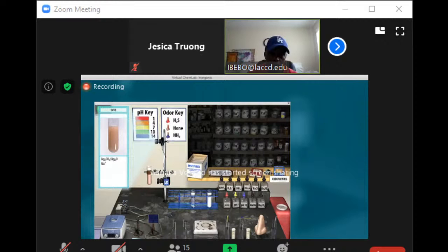Just like Adriana did, you can show me your own lab bench. Okay, let me see. Okay. Good. All right. So I have these two so far. Oh, okay, you have them already. Yes. Okay, so you're going to pick up the one that is clear.